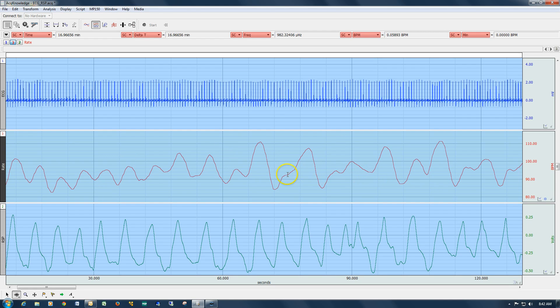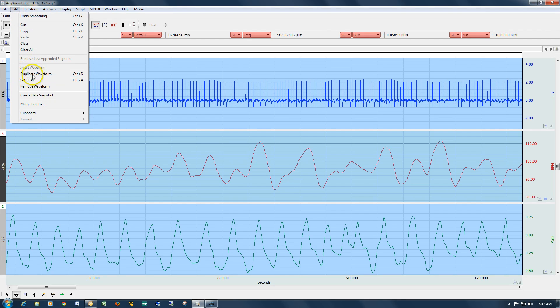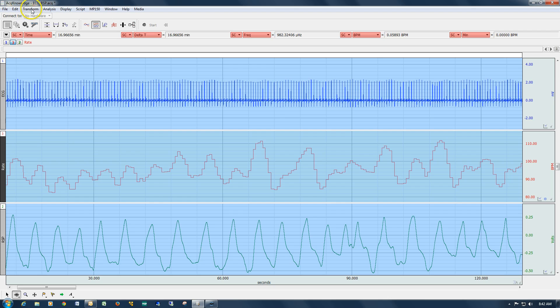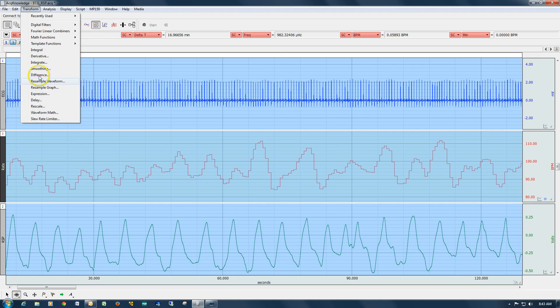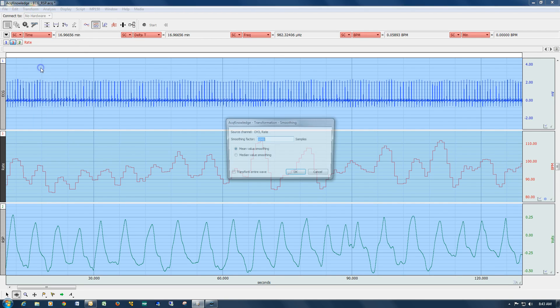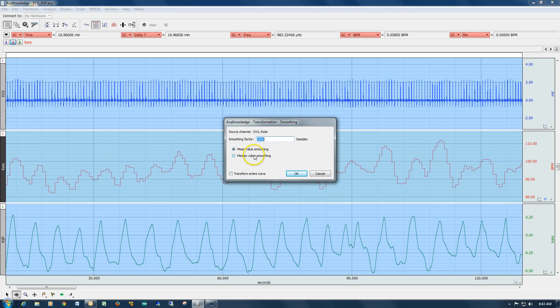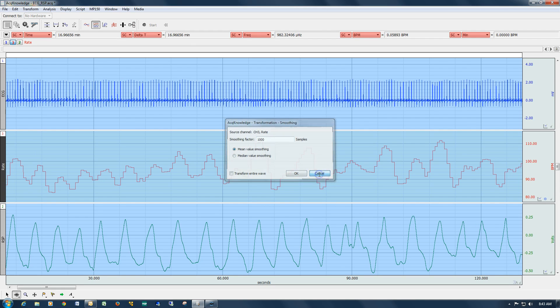So that's a good example of the mean smoothing. Now what I'm going to do is give a demonstration of the median smoothing and how that can be useful.